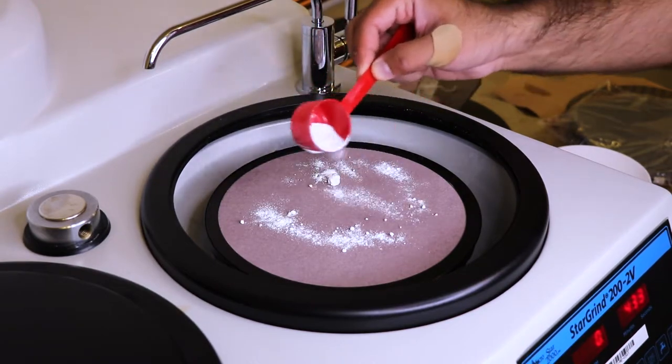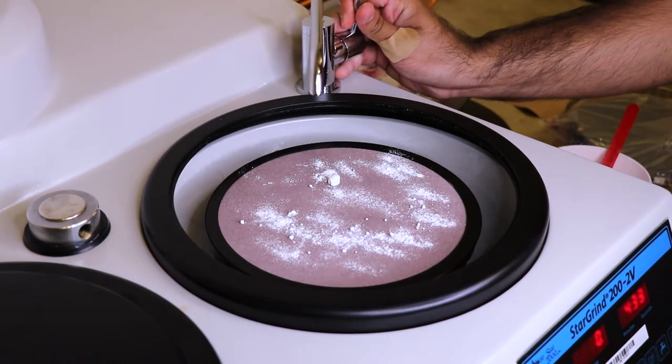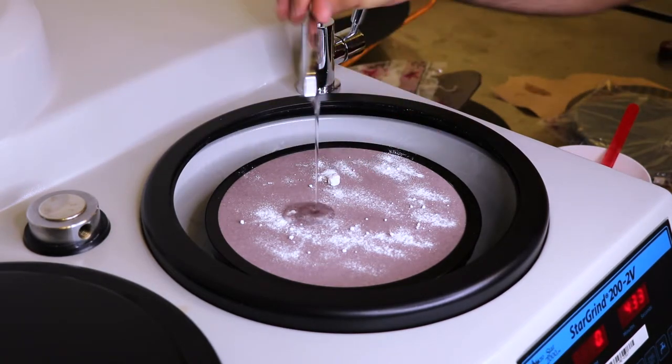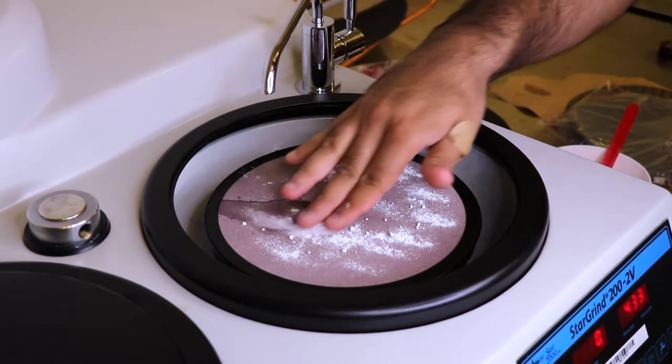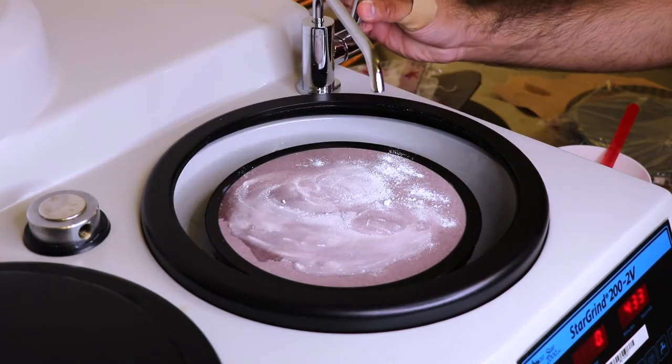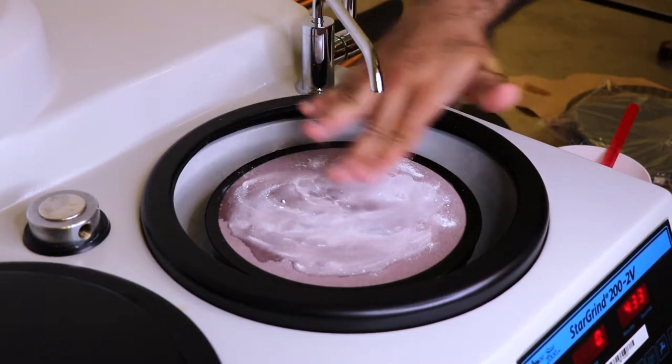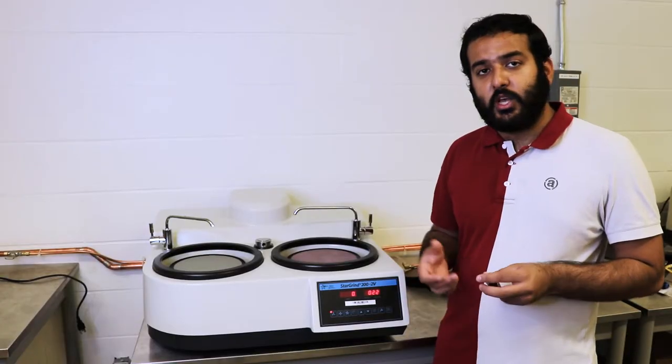Then use a little bit of water to make it into a paste. And then as you polish, add a bit of water or keep the water trickling just so that you don't wash the alumina off, but you keep it moist.